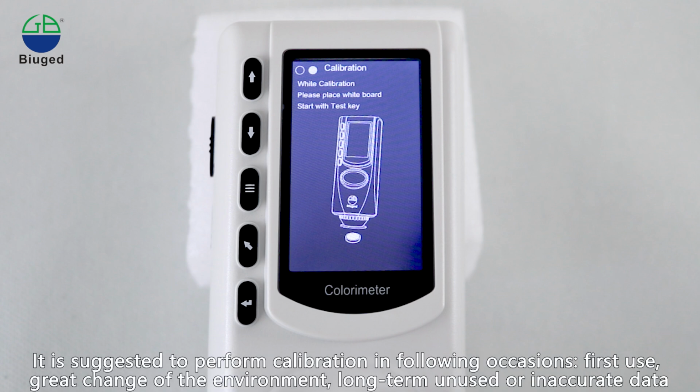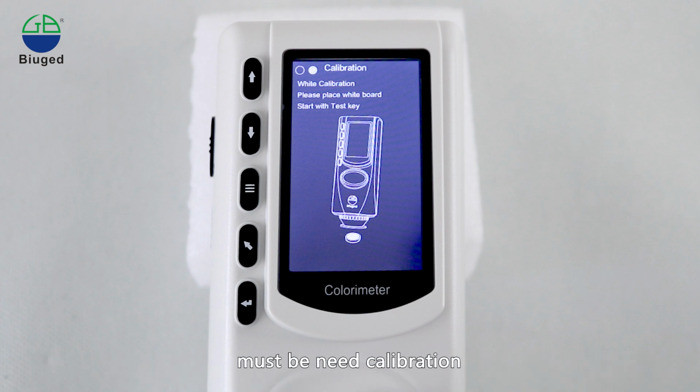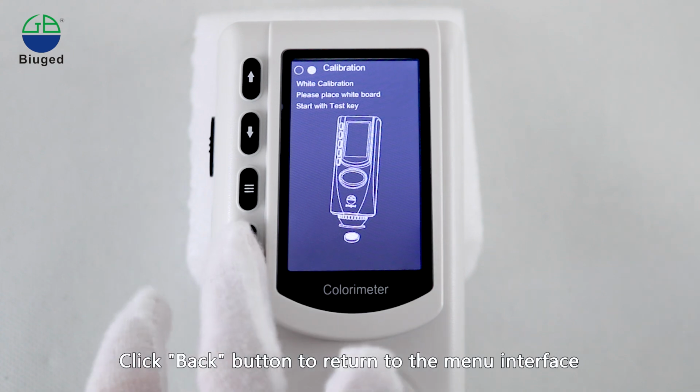It is suggested to perform calibration on the following occasions: first use, great change of the environment, long-term unused, or inaccurate data. Calibration is needed in these cases. Click the Back button to return to the menu interface.